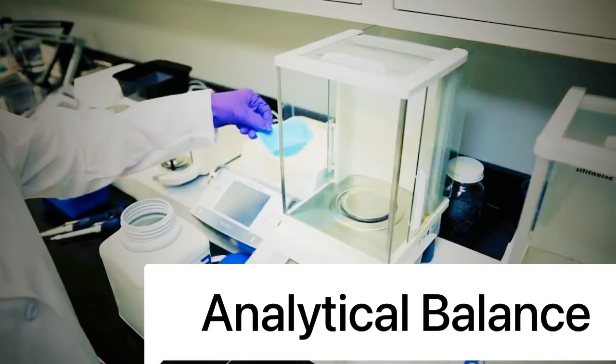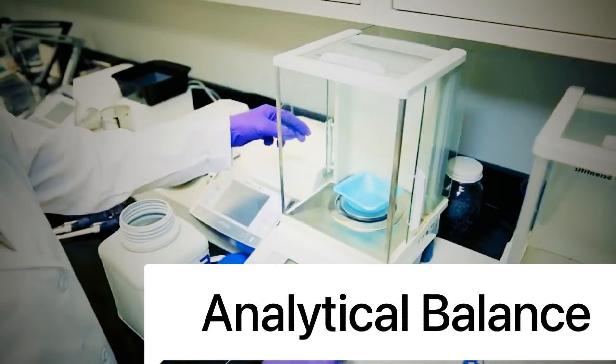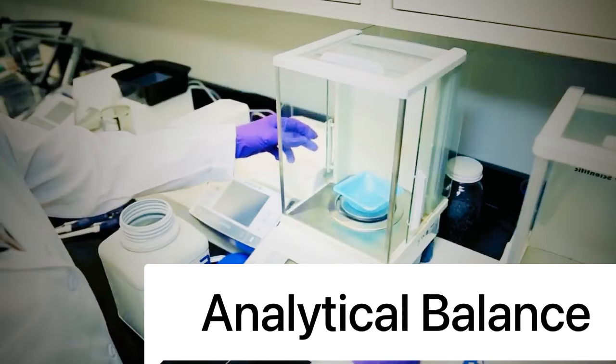Analytical balances. Analytical balances are extremely sensitive laboratory tools which were developed to correctly measure small masses in the laboratory.